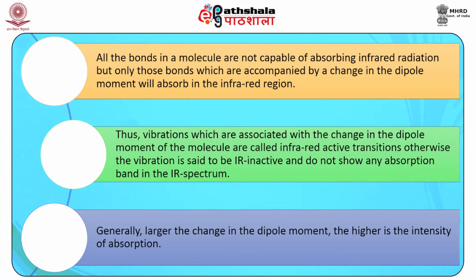spectrum. Now, generally, larger the change in dipole moment, the higher is the intensity of absorption. Hence, the vibrational absorption bands in simple hydrocarbons are weak, while bands associated with bonds connecting atoms with a considerable electronegativity difference give stronger bands, because then the dipole moment change will also be large.